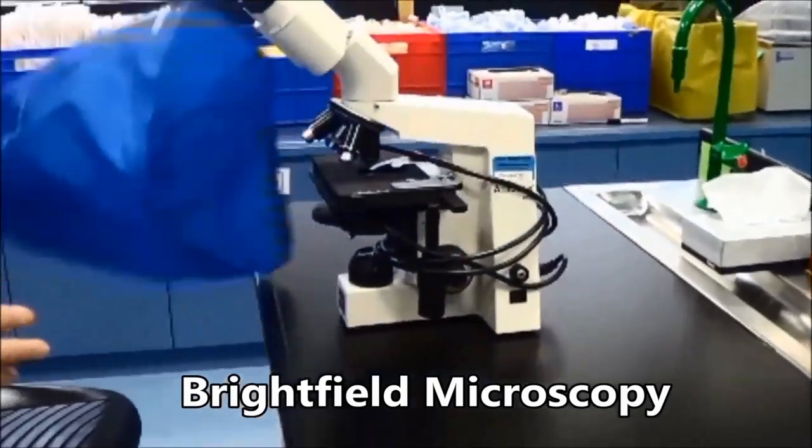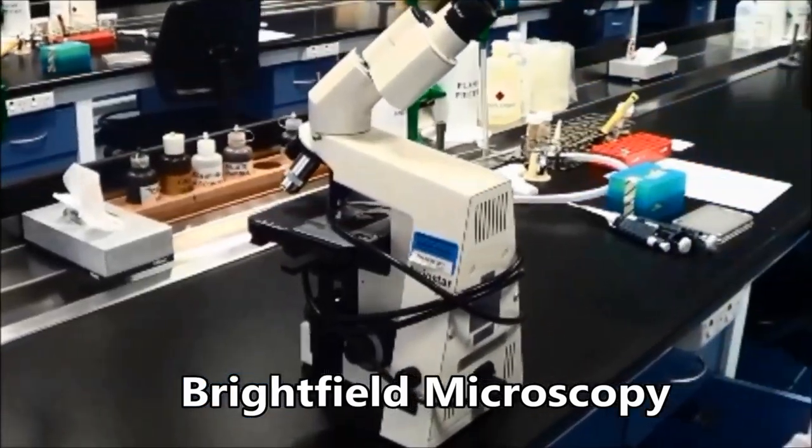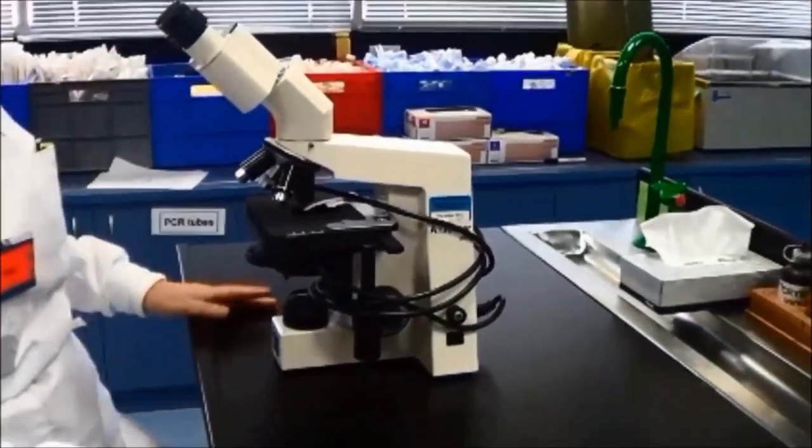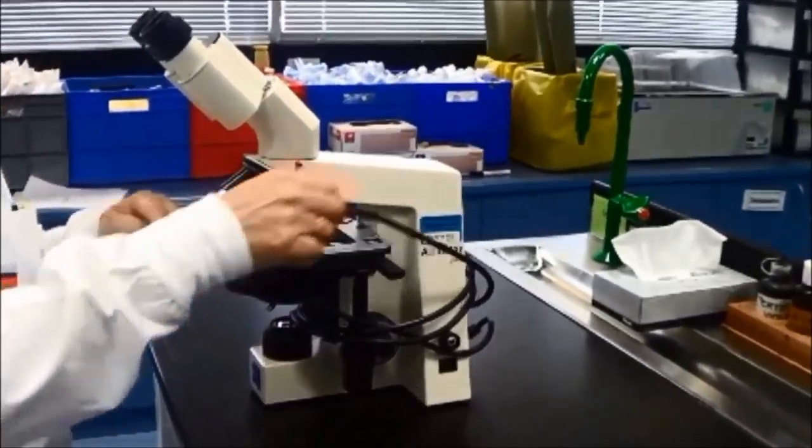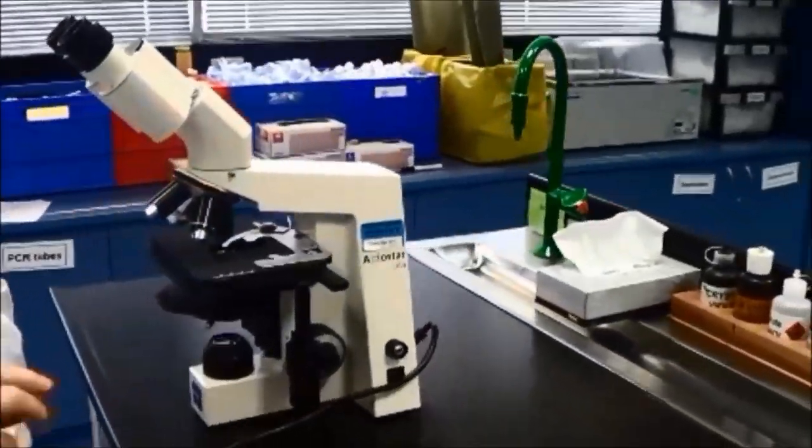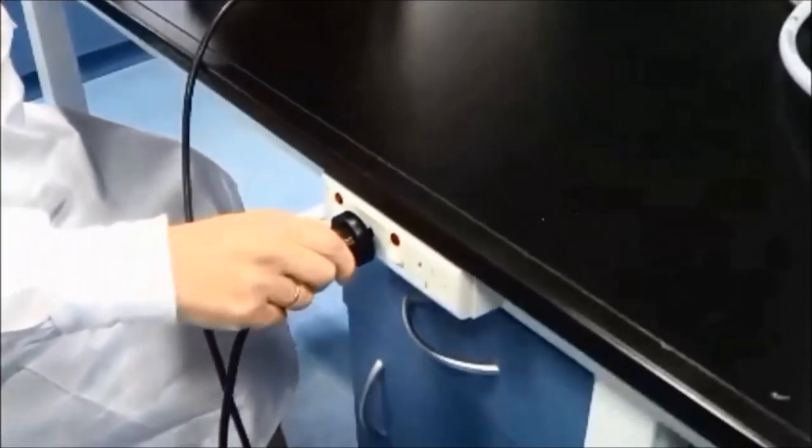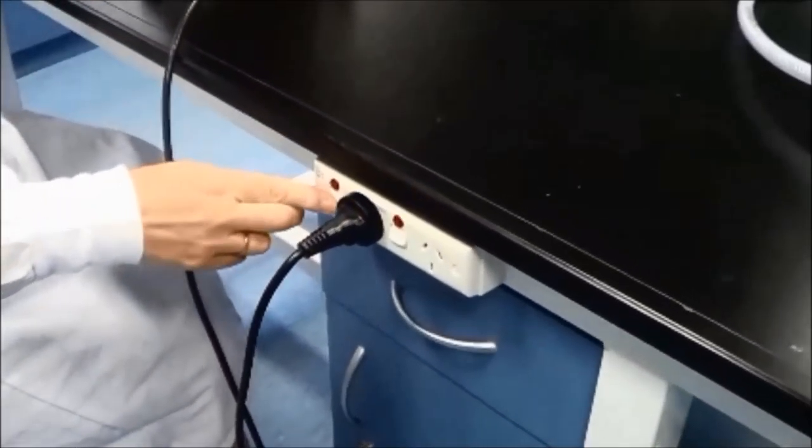Carefully remove the microscope from the cupboard and place gently on the bench with the eyepieces pointed towards you. Remove the dust cover and replace it in the cupboard. Turn the microscope on and adjust the brightness to an appropriate level.